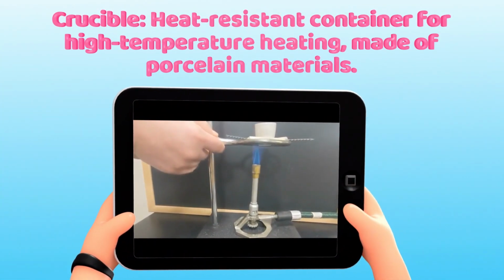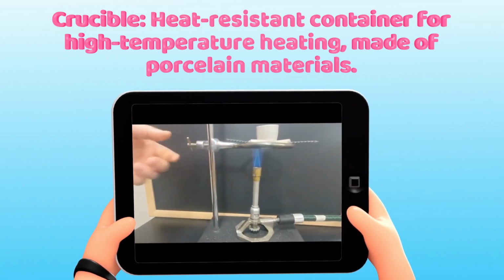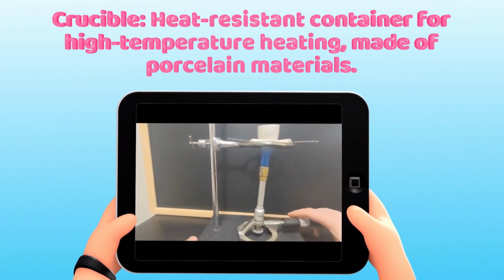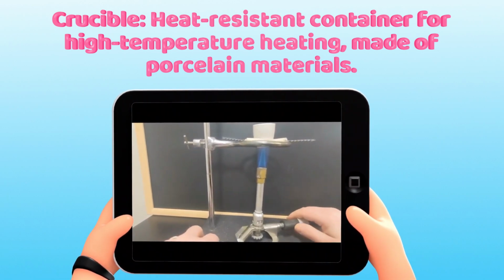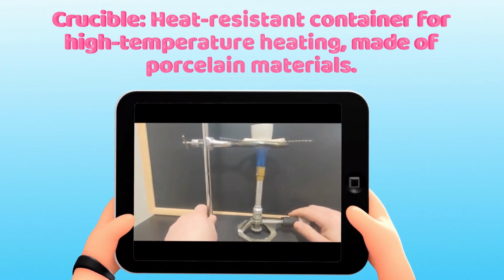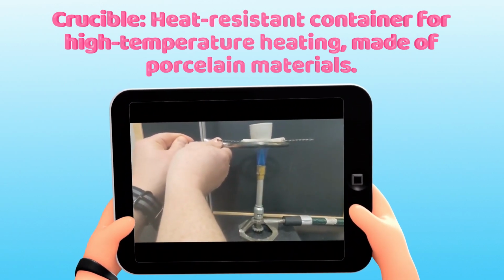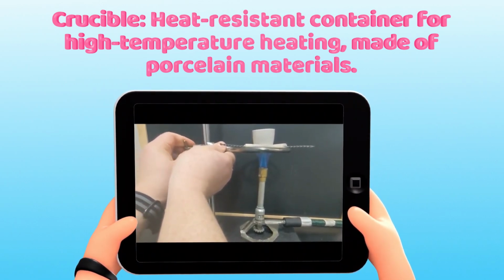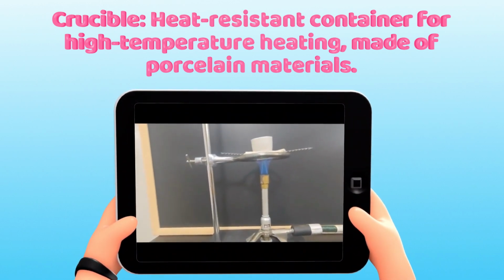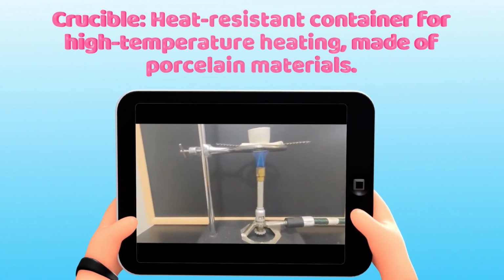Another one is the crucible. A crucible is usually used as a heat-resistant container for high temperature heating. This is made of porcelain material. As you can see from the screen, the item put just above, at the top of the wire gauze, is what we call a crucible. It is like a cup.